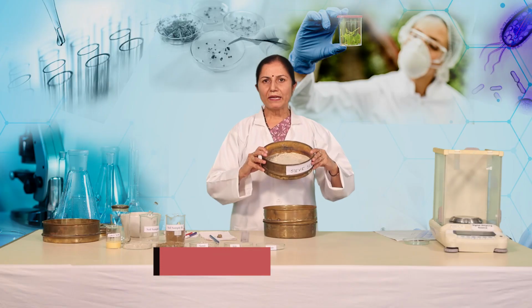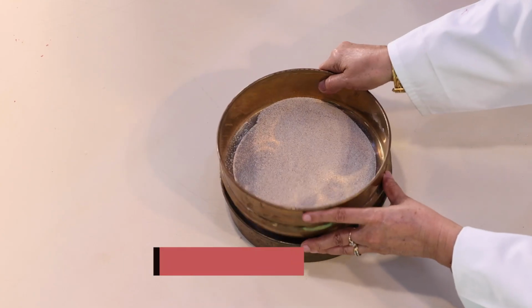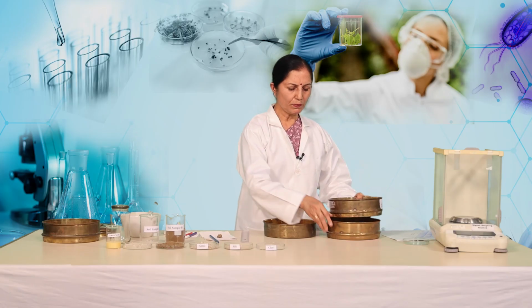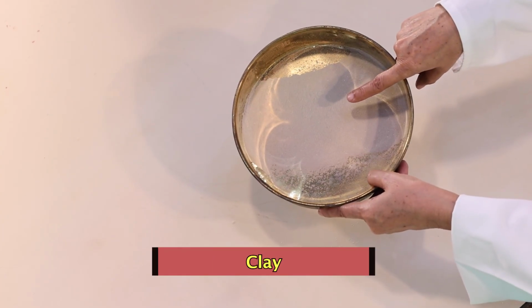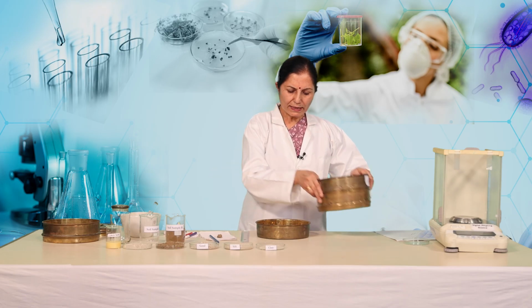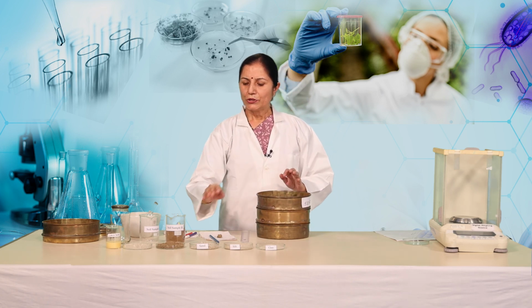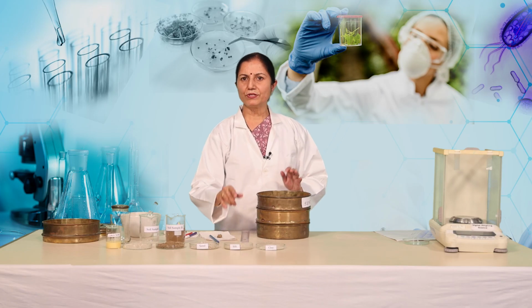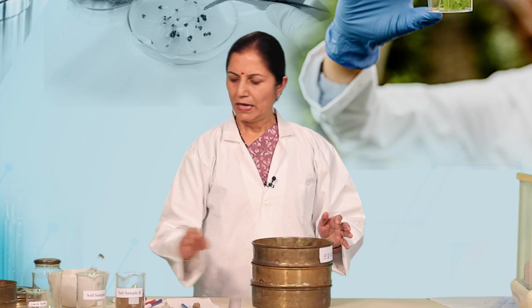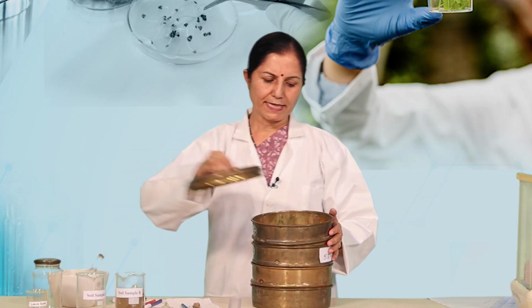The sample that will be collected in this layer will be sand. The second layer will have the silt, and the bottommost part will have the clay, that is the smallest particle size. We can collect them in 3 different petri dishes and we can weigh them. The total weight of the 3 fractions should be equal to the weight of the total soil sample taken. Now, we have to calculate the percentage of these soil fractions.